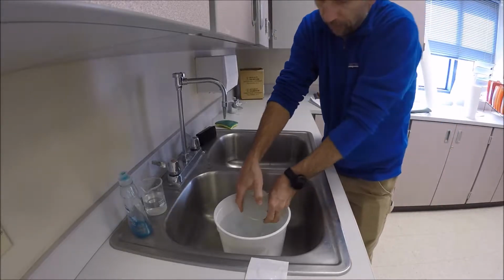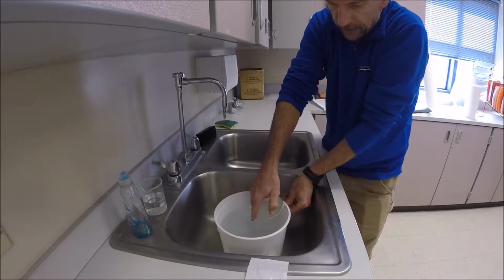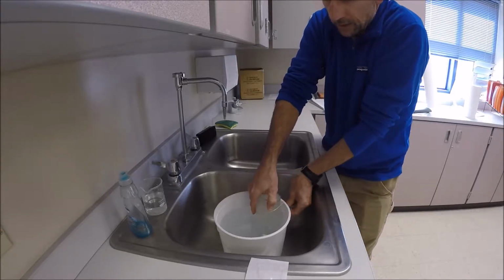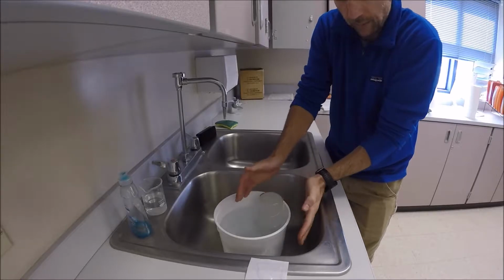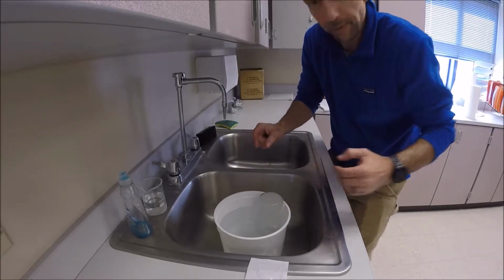The reason I had that rubber band on there earlier is I'm going to slide half the rubber band up the side, as long as it doesn't slide and snap and spray water in my face. You're going to hook this over this little part of the bucket, and it will essentially balance there. And I'll carry it back to our lab station where we'll pick up next.